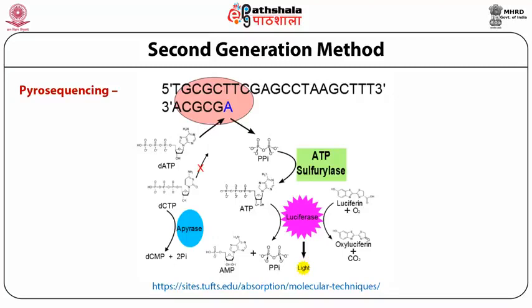This light can be captured by a camera and that will indicate what kind of nucleotide is inserted at a specific position. So one nucleotide is added at one time. So this is the beauty of this technique.